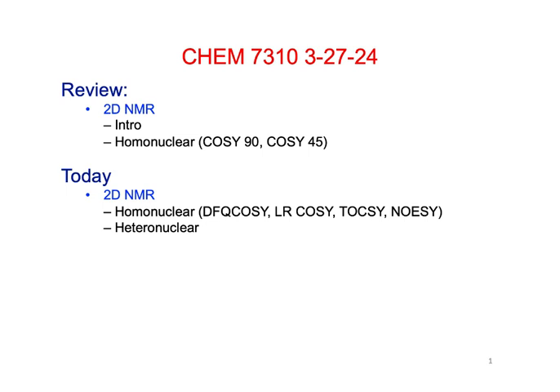Remember that with the time domains, we have T1 and T2. So this is the acquisition, and this is the evolution time. And when we do the Fourier transforms, the T2 dimension ends up being F2, and the T1 goes to F1.